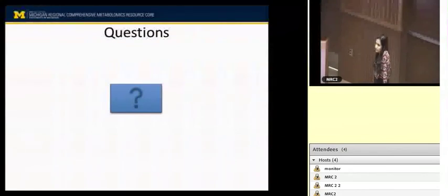You don't always have class information. Okay, so at the end of trying different methods, will you pick one, or apply multiple normalizations? For just lipidomics? Yes. Like I said, you need to check before and after normalization how it's changing your data. You just don't apply it and say, oh, this is fine. You have to see how your QCs are changing, how overall your data is looking. PCA is a good way to see how it's changing your data overall. So you apply different methods and see which one looks best, and that's what you pick.